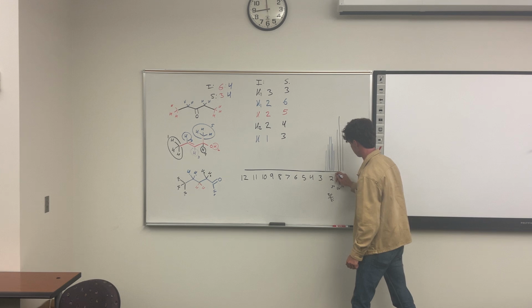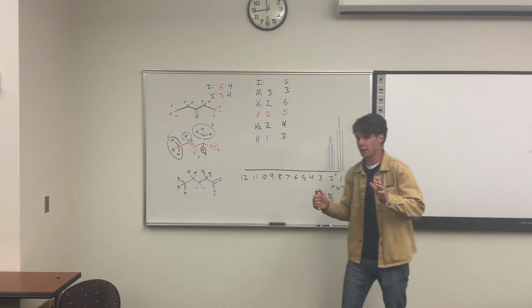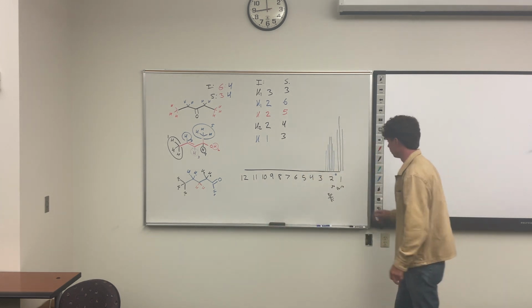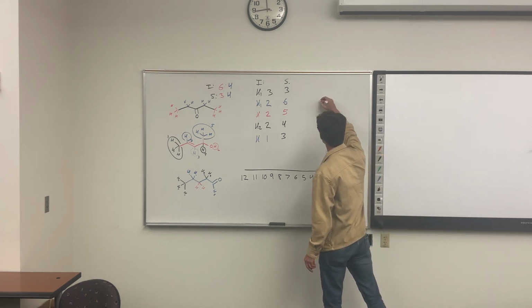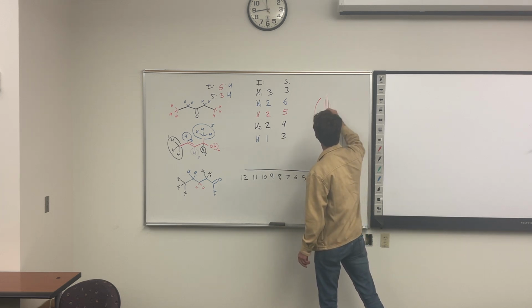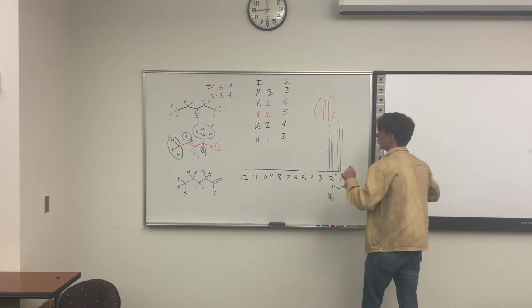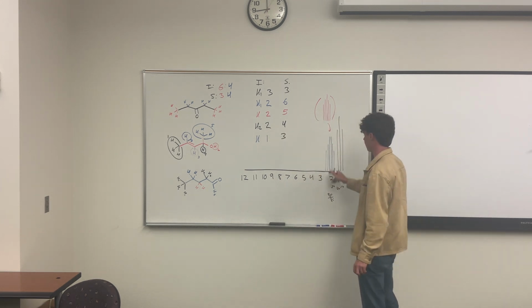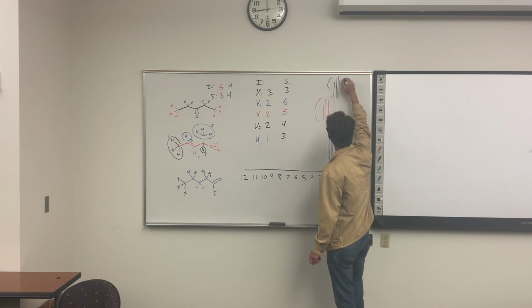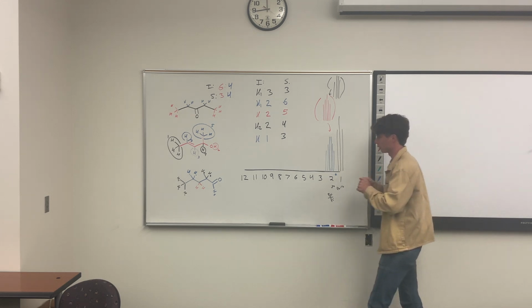This should be right around in this area here. All of these 3 groups are all going to be in the same spot. Again, it's overkill. They'll design it in a way to where it does not overlap like this, but it's just extra practice. So we'd expect this to be in about the same spot, intensity of 2, split into 5. The same spot as our blue. And our H2, intensity of 2, split into 4 at about the same location. So all those are going to be overlapping right around this star right here, right about 1.5. That's where our secondary groups go.